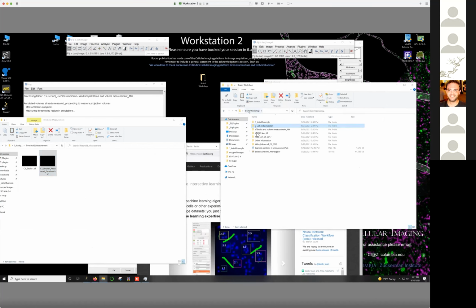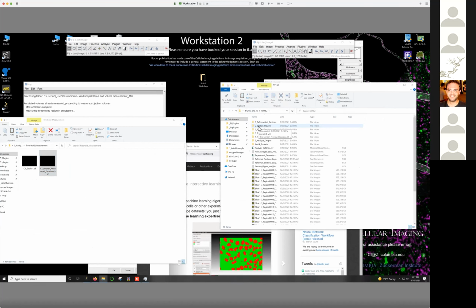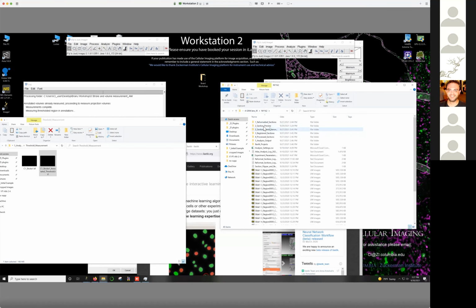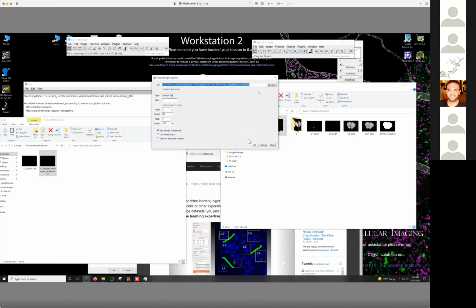So here, this is a good example where we have a GRIN lens that's been inserted into the brain, and you might want to measure where the lens is, but you might also want to know, okay, where was I imaging exactly in the brain? And so this is a data set that Anej was able to share with me, and we can look in here, and so I'm just going to show you. And we can see this pretty clearly on all the channels because there's a big chunk of the brain missing.